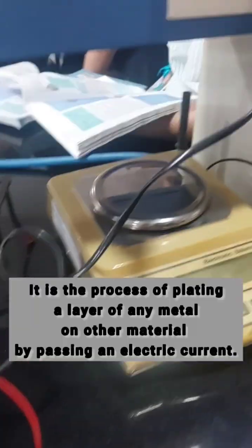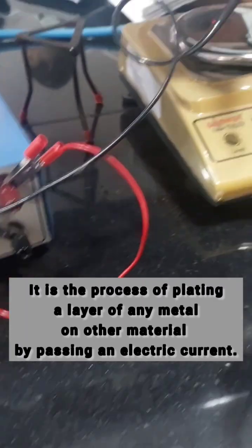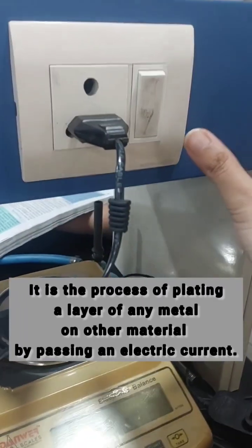Dear students, today I will tell you about electroplating. It is the process of plating a layer of any metal on another material by passing an electric current.